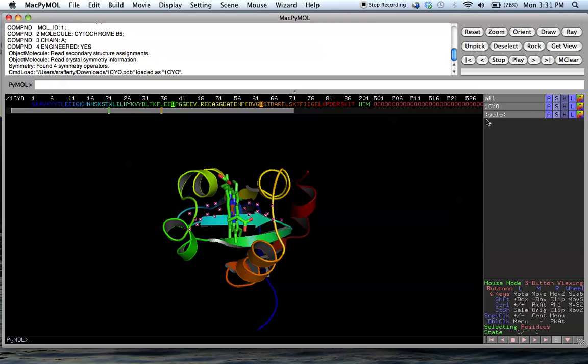This is our selection now. So whatever actions we perform on those things we've selected will only be restricted to those selections, not the protein as a whole. So if we want to change the view of those things, we go to S, Show, and for the sake of argument, we'll just change them to sticks, although you can see the other choices you have here, and I suggest that you play with them as well too.